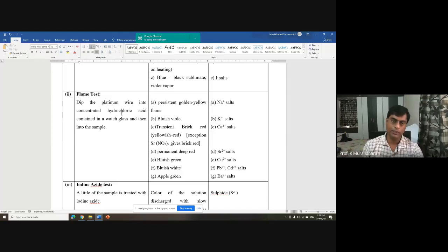When you show that to the Bunsen burner flame, you may see a golden yellow flame. Last time Bhaskar sir explained clearly that there are various parts of the flame, but most of the time it will be mostly blue, the entire part, with different shades of blue. Now if you see that the flame is turning yellow, there is a chance for sodium salt. So how are we going to write?